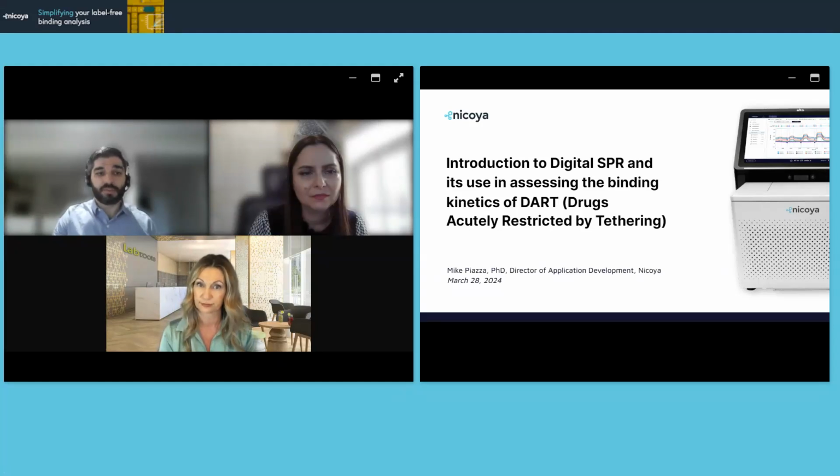Yeah, that's a good question. So the cost of the cartridges currently are $90 per cartridge. Now, if you buy in bulk, there are discounts for bulk purchase. Again, the cartridges are single-time use, but on the cartridge, we can run up to 48 unique interactions.